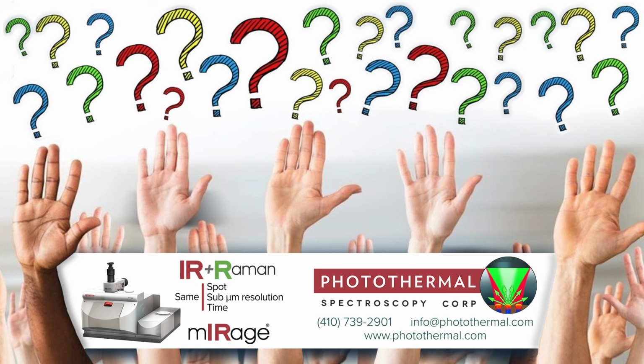Thank you. The next one might be one for me. How does O-PTIR not suffer from fluorescence if you use a Raman laser? That really goes back to my point earlier about how we use a Raman grade laser. Now that's pretty simple. The QCL infrared laser that we use is modulated.